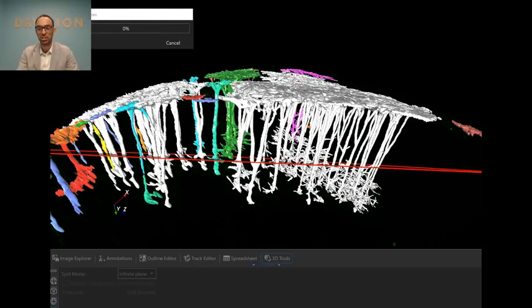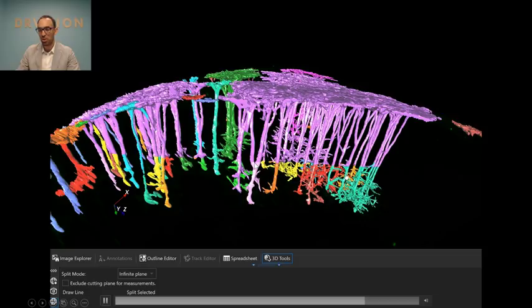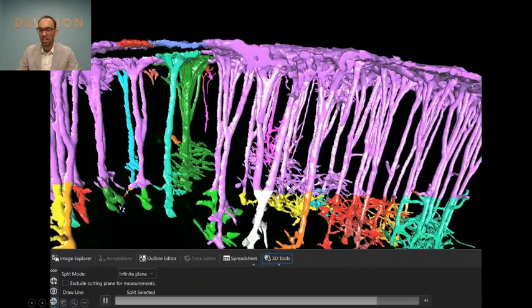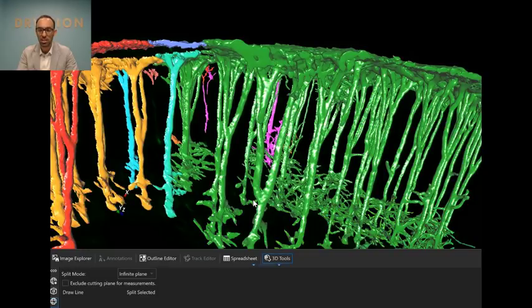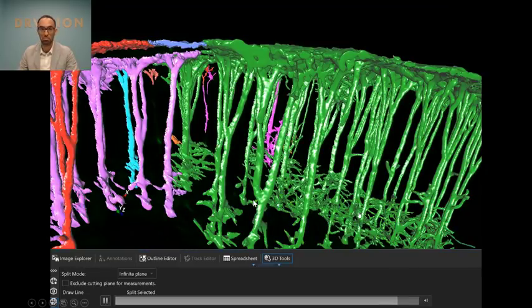This, of course, takes a little bit longer because it's cutting quite a few others, not just the single small one. And after that, they'll all be colored differently. So the ones on the bottom are now independent objects, so they have independent colors. And you can see that quite clearly there. I'm selecting a few of them. Our standard selection color is white. You can see that. And what I just did there was an undo. So if I go back a couple steps, you can see here I press undo, and they all become connected again.